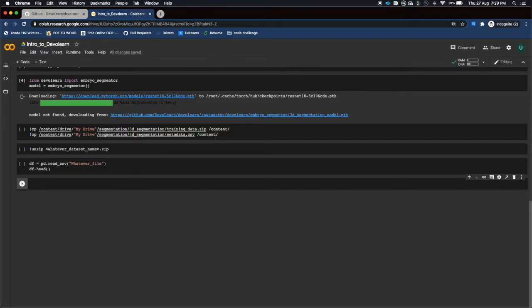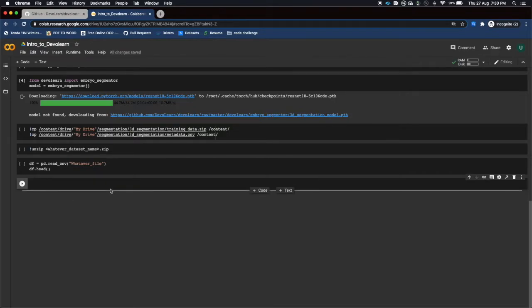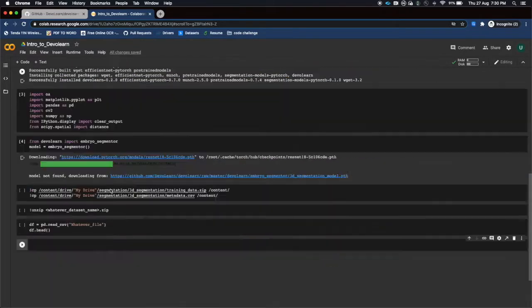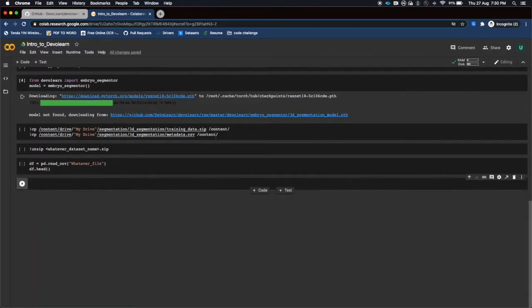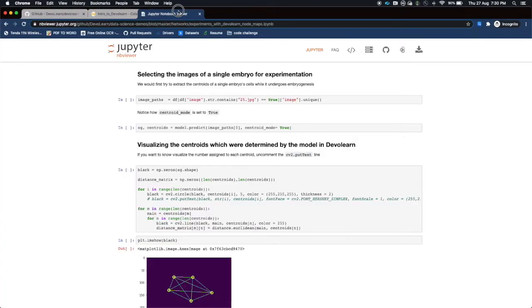Then we move forward to selecting the images of a single embryo for the experimentation. We should try to extract the centroids of the single embryo cells undergoing the embryogenesis process. Let me now just quickly, after showing you the basic setup, show you the Jupyter notebook that we are working with.